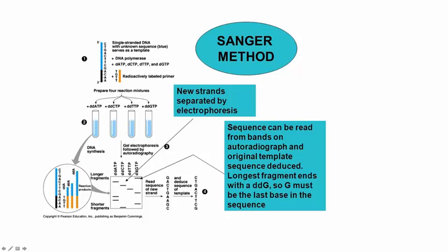This gel was loaded as A's, C's, T's, and G's, but you're still reading from the 5' to 3' direction, reading that new sequence that is being created, which happens to be the opposite of that original template strand. So you just need to make sure that you understand which sequence you're talking about, that when you are talking about the newly created strand that you're reading the sequence of here, it's the opposite sequence of the template strand that you were just sequencing.